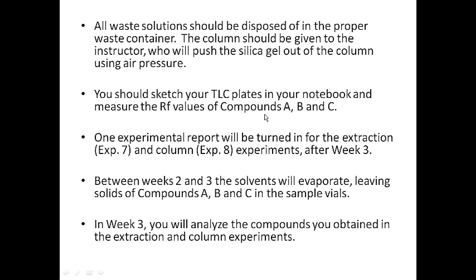Now, one experimental report is going to be turned in for both the extraction and the column chromatography experiments. So consider experiment 7, what you did this past week, to be week 1, the column experiment to be week 2, and in week 3 we're going to do the analysis of all of the different components that we got, both individually and as a group, to see how the purity of the components matched up in these two experiments.